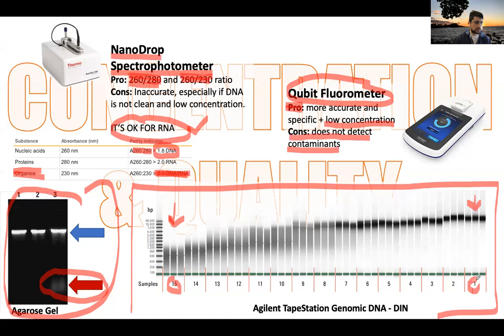For some applications, it's really important to have high molecular weight. For example, the third generation sequencing approaches that I was talking about before, PacBio and Nanopore, are able to read longer molecules. So for some applications, you want to have very high molecular weight. You may want a preparation of genomic DNA that is more similar to lanes 1, 2 versus lanes 15 or 14 that are very degraded. So this is another type of quality control that you can perform depending on the type of preparation.